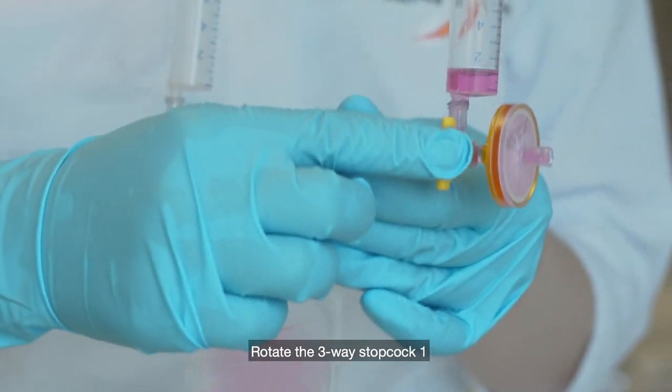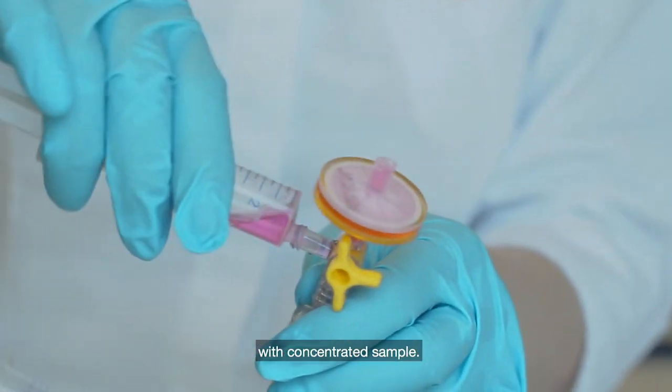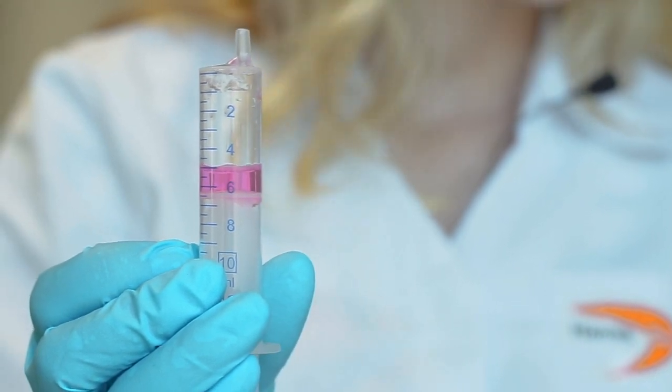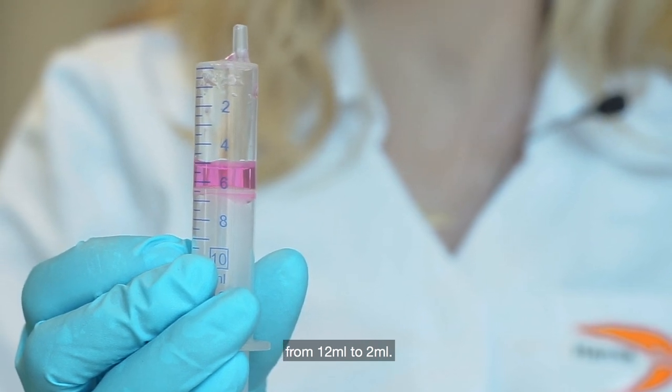Rotate the three-way stopcock 1 and disconnect the syringe with concentrated sample. Concentrated sample is ready. In this test, volume was reduced from 12 milliliters to 2 milliliters.